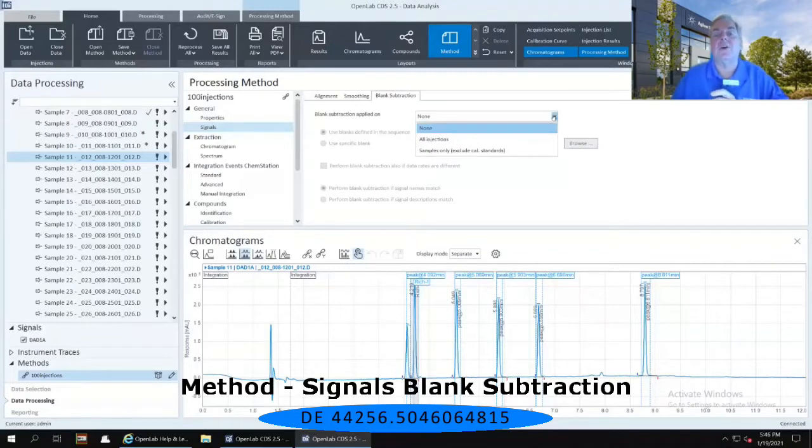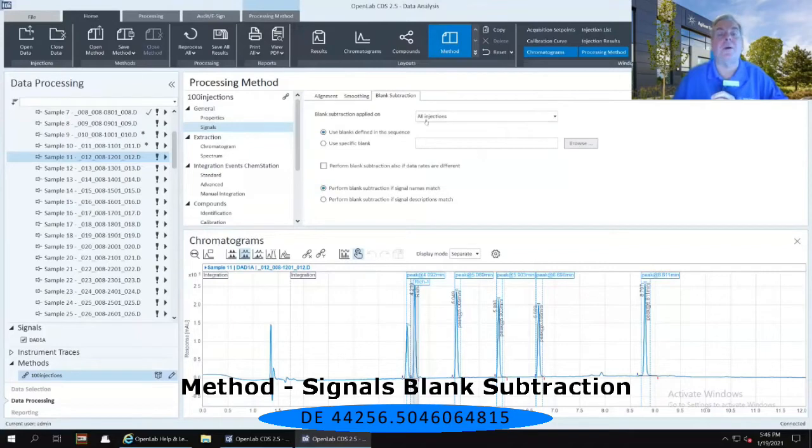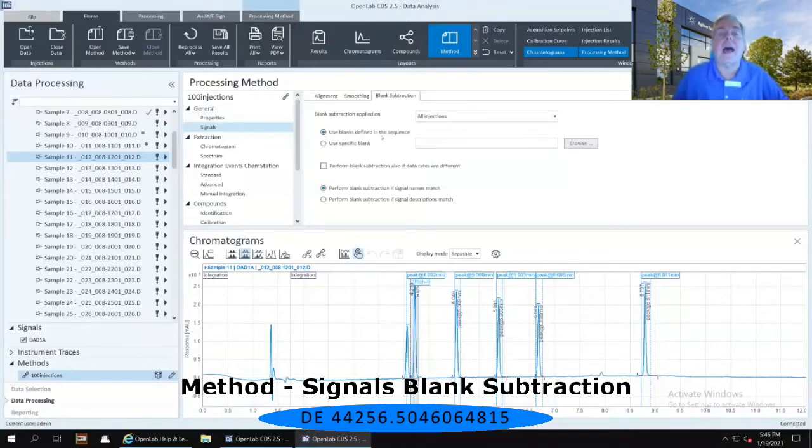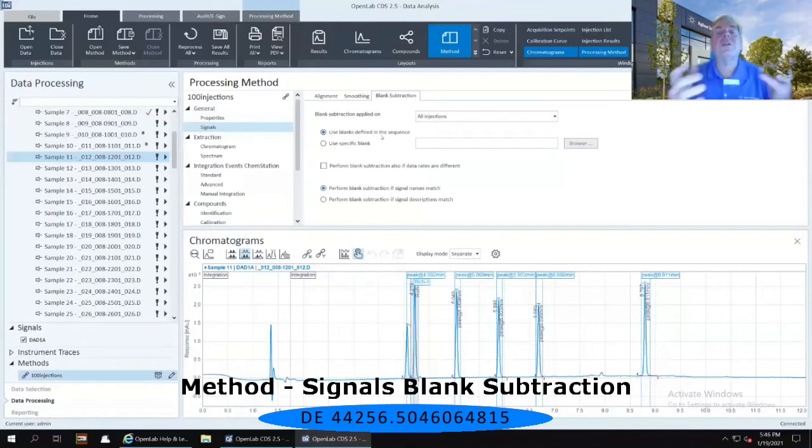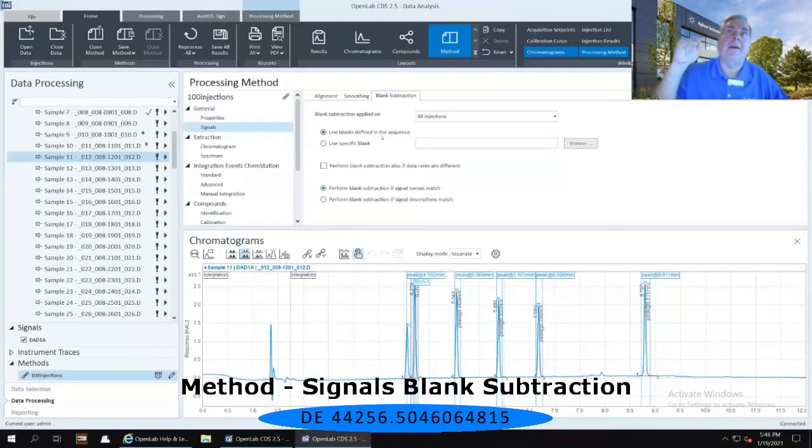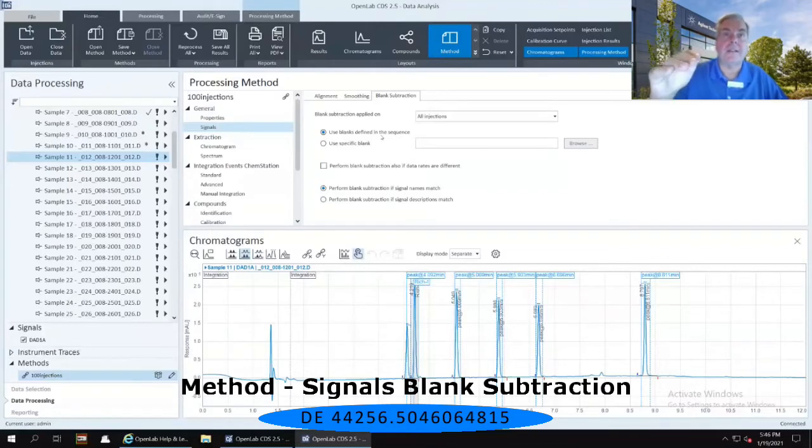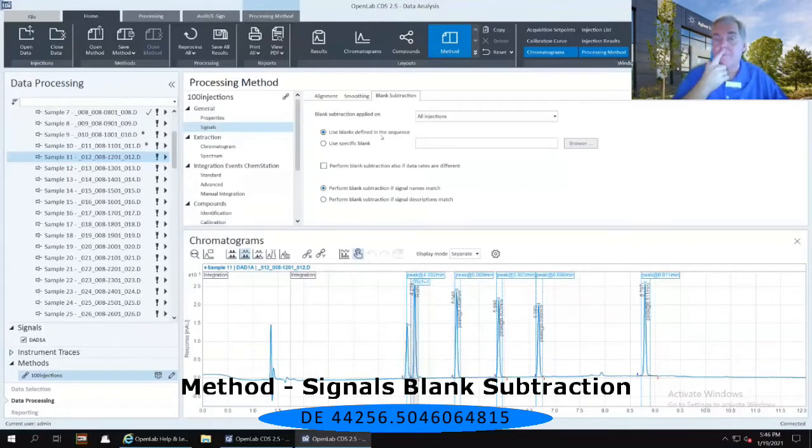So if I select, for instance, all of my injections, it then opens up an ability to use either blanks defined in the sequence. Which blank is it going to take? Let's say I have a blank, followed by ten samples, followed by another blank, followed by another ten samples.